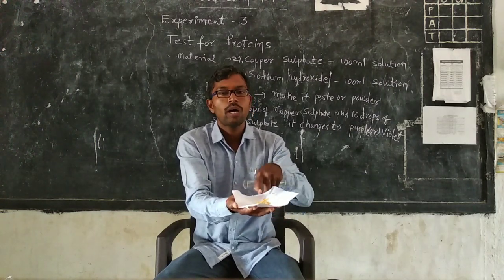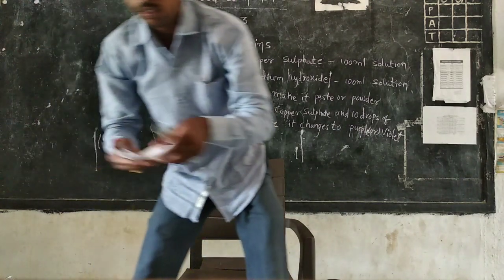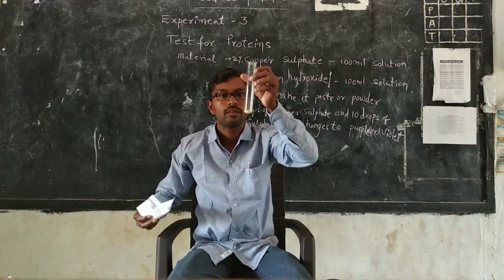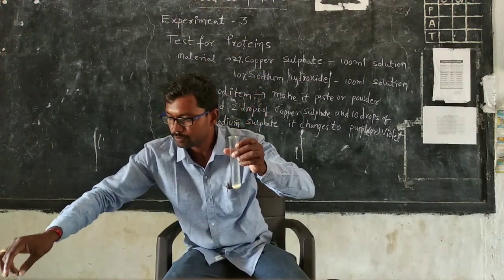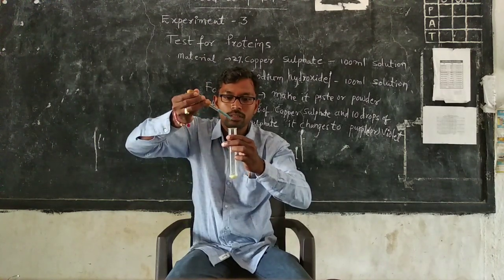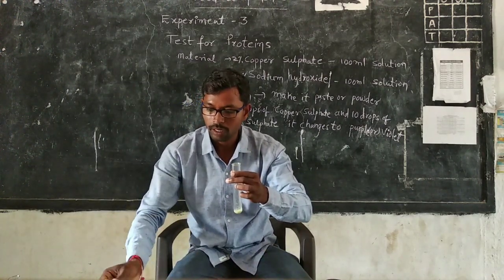Before testing, we have to paste the food item. Now I take this pasted dal into the test tube. The next step is to add two drops of copper sulfate, then ten drops of sodium hydroxide.